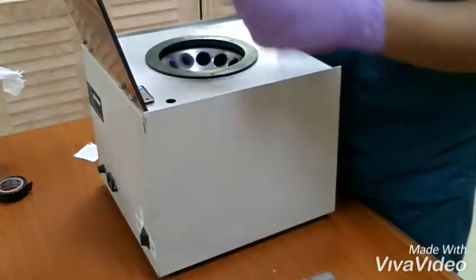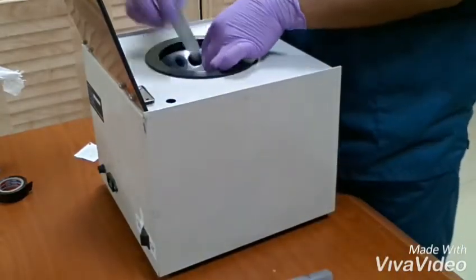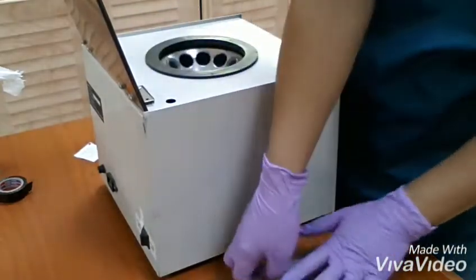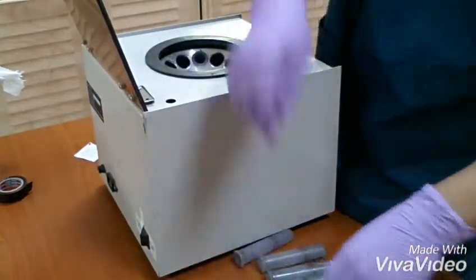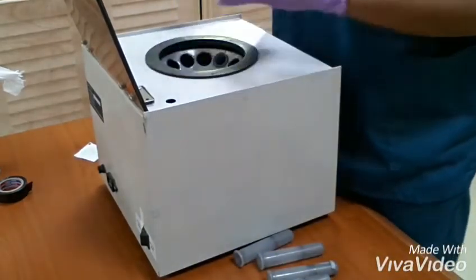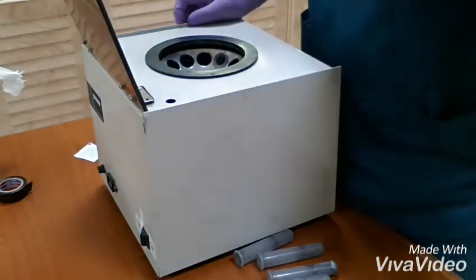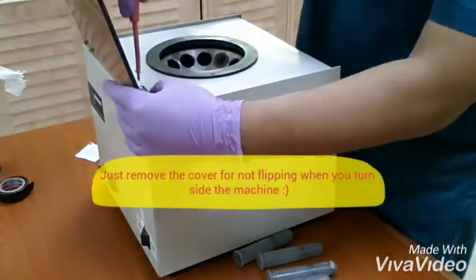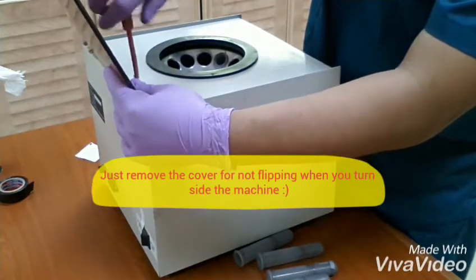Let's see what the problem is. We will be opening the machine. First, we have to remove all of this so that it is very easy for you to access.